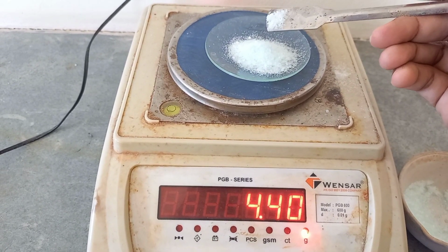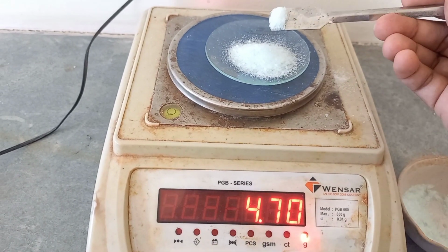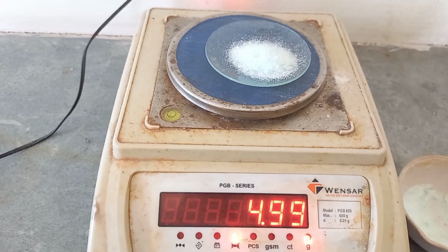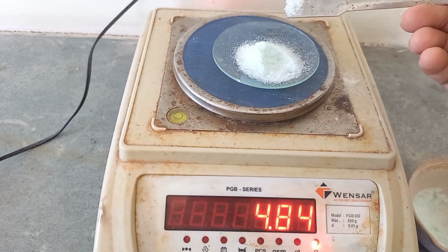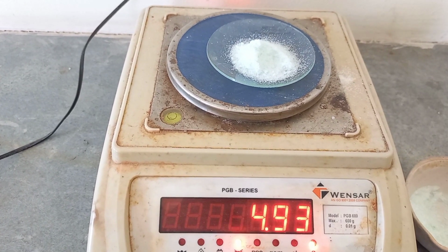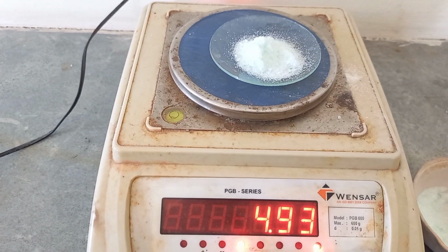Here in my electronic balance, it is very easy to take the amount of 4.9 gram. So I am taking the exact amount of 4.9 gram, which we are going to use for our preparation of the standard solution.